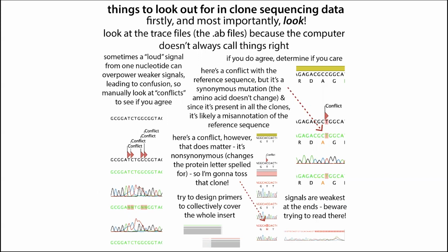Sometimes when you go to align the sequence, you find that this isn't actually aligning, especially if you just start with the sequence file and then try to align it. If you're trying to manually align it, you're going to want to choose a part of the sequence that's in the middle, because remember those ends are going to be unreliable. You can take a middle part of the sequence, try to align that, and align the whole thing based on that.